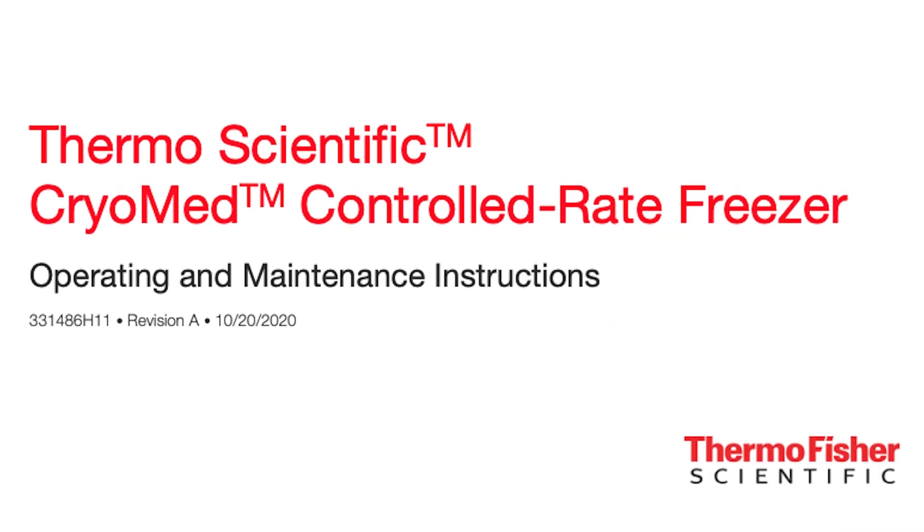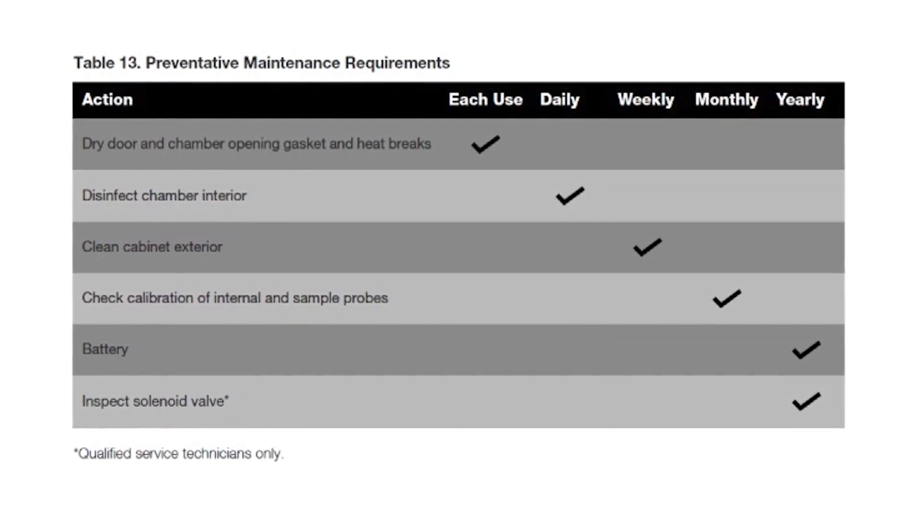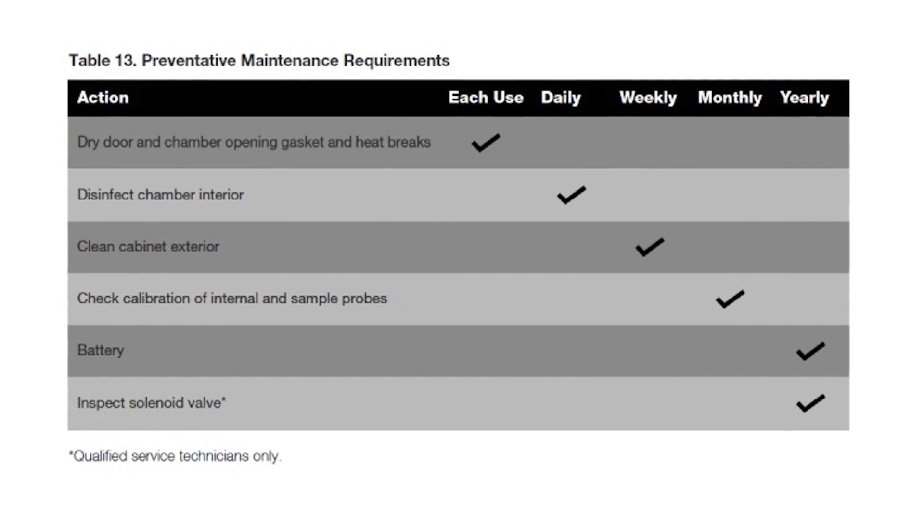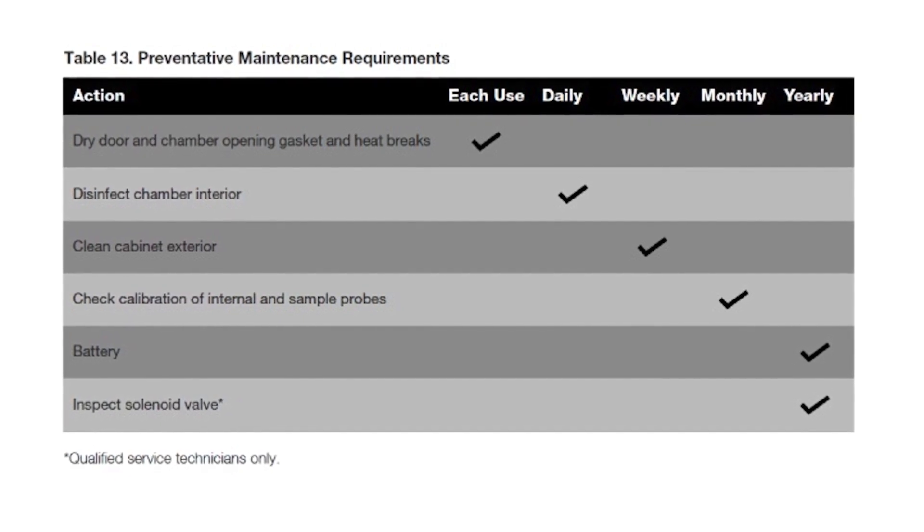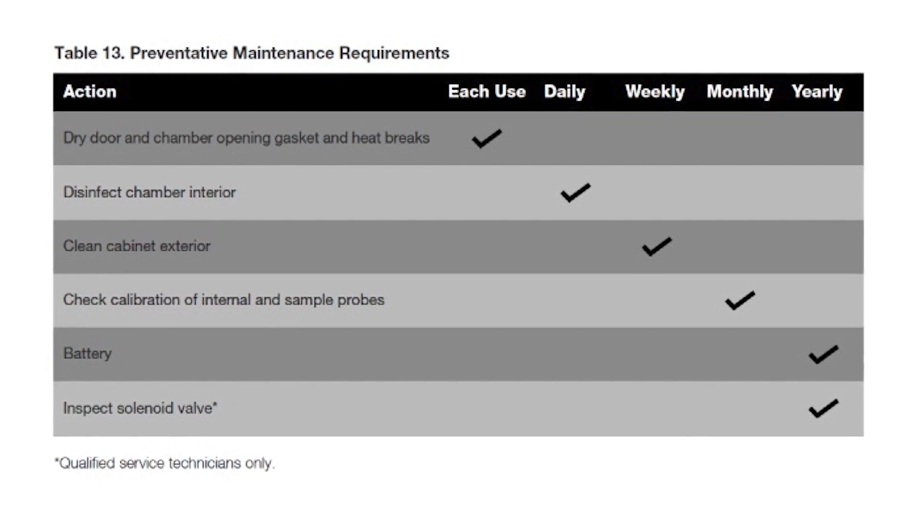In the user manual that came with your CryoMed controlled rate freezer, you'll find a number of preventative maintenance requirements and the cadence at which they should be performed. During this video we will discuss and demonstrate each recommended action to prepare you to appropriately care for your new CryoMed unit.